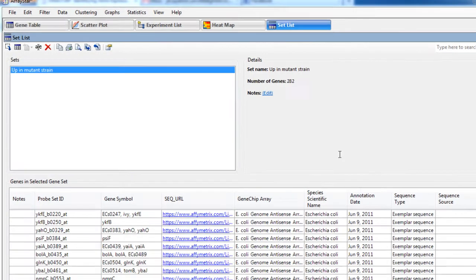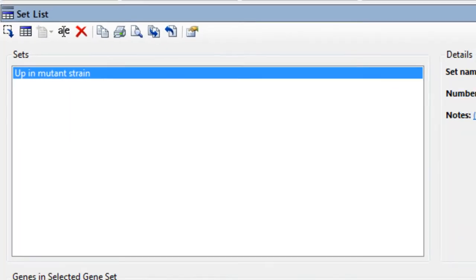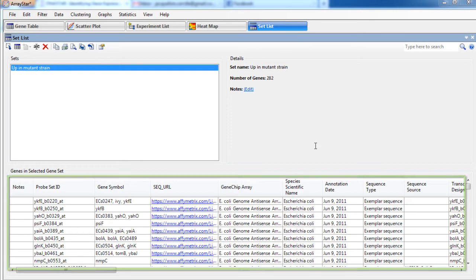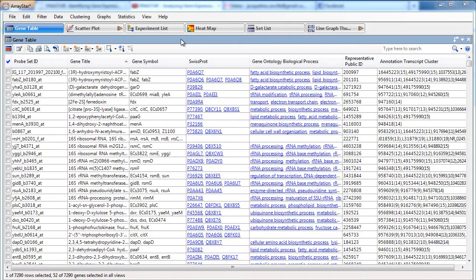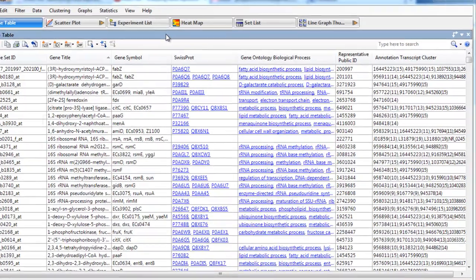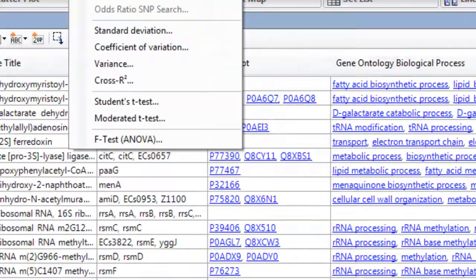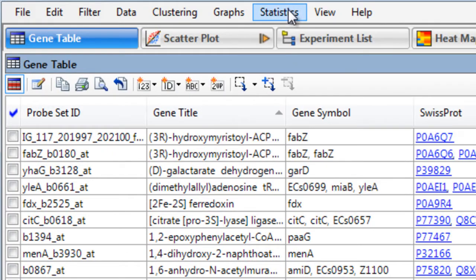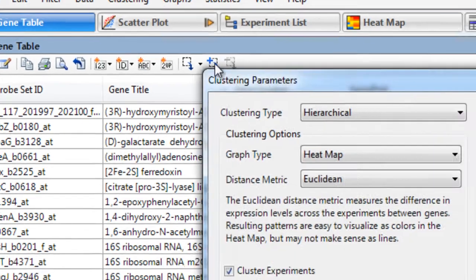The Gene Set List view displays all of the gene sets for your project and provides details for each one. ArrayStar provides many ways to analyze your data, including viewing annotations, statistical analysis, and multiple clustering algorithms.